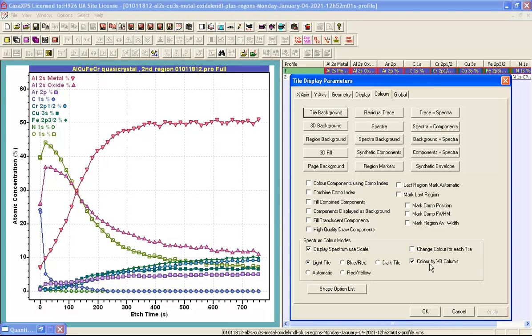The result of this tick box is instead of coloring the traces in the order of selection of these VAMAS blocks in the right hand side the colors are now determined by the position in terms of the column position of these VAMAS blocks in the right hand side.